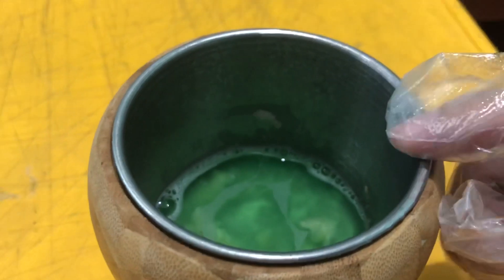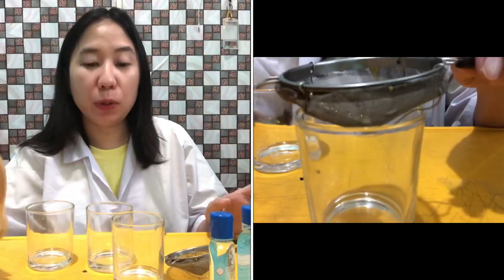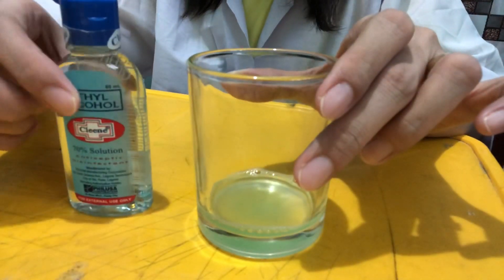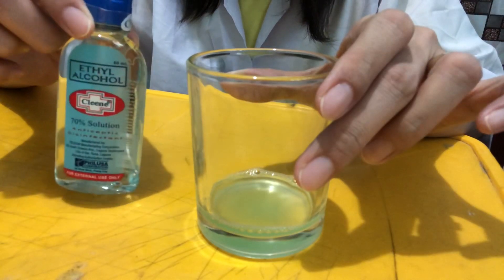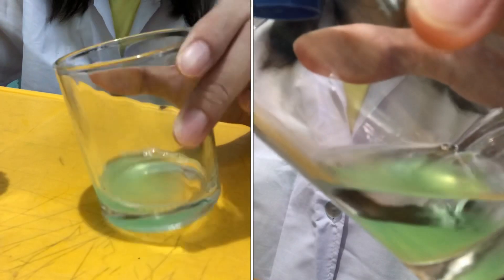15 minutes is over, so we can now pour our solution into our containers. We're going to pour in 70% ethyl alcohol into our solution.